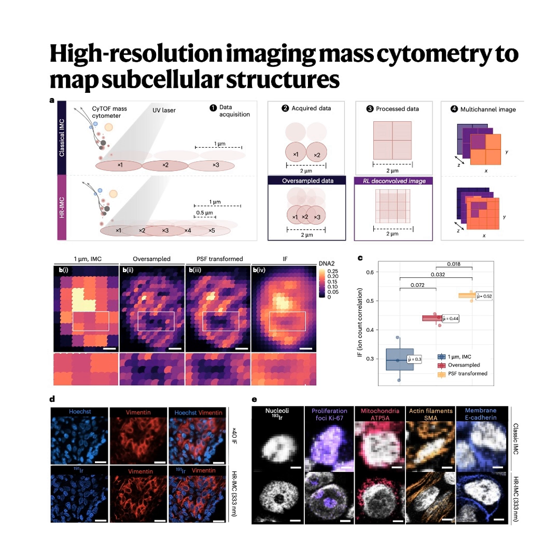So the technical difficulty there is that when a B cell, which is CD20 positive, and a T cell, CD3 positive, are crammed right next to each other, a 1 micrometer laser shot is going to hit both of them simultaneously. Exactly. And classic 1 micrometer IMC averages those two signals, resulting in this impossible hybrid cell artifact they call a B and T cell. Which is just a flaw in your analysis. It's a fundamental flaw. If your platform misidentifies adjacent cells as one giant hybrid cell, your entire quantitative analysis of that immune microenvironment is worthless.